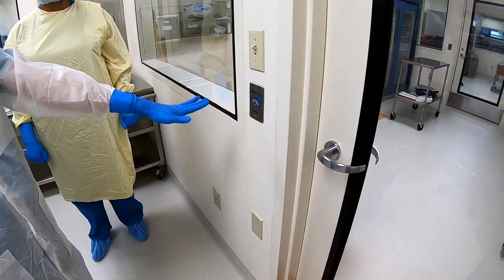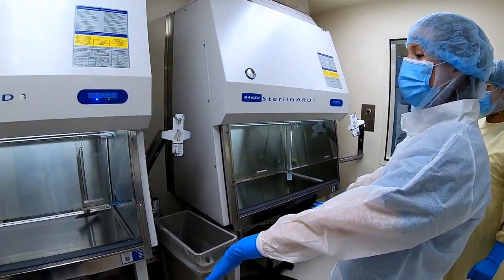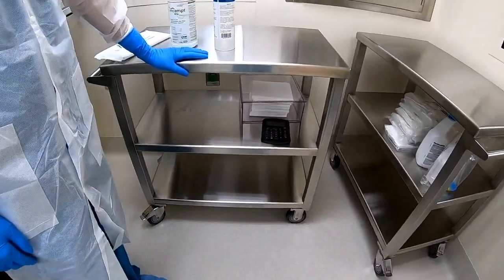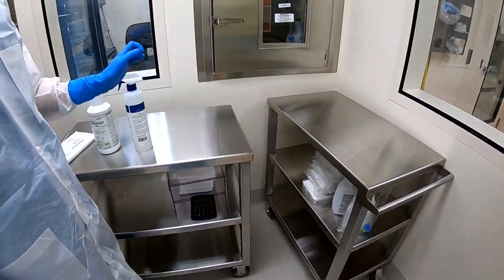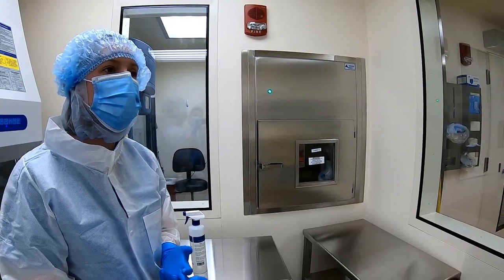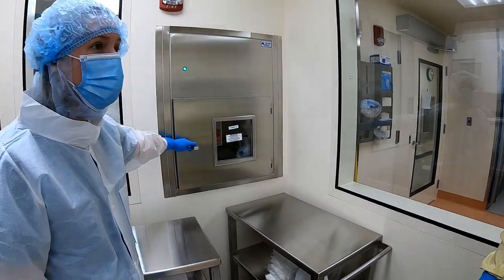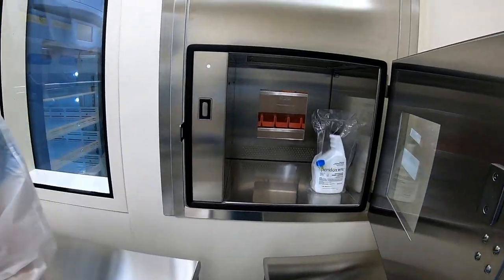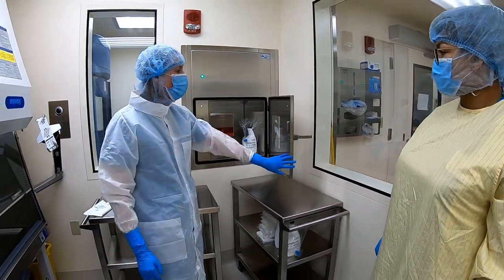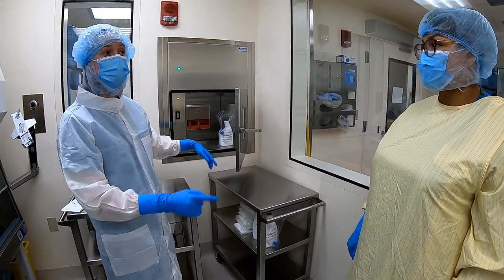We have two hoods available for use and two carts for supplies. All of the drugs are now going to be in the HD storage room on the other side. The only supplies you'll have in here are your cleaning supplies, syringes, needles, tubing, and so on — all drugs will get passed through this pass-through, which is HEPA filtered and very big with lots of room to pass things through. There will be an SOP for you to read about how to clean and pass things through. Unlike the fridge, you cannot open both sides of the pass-through at the same time.